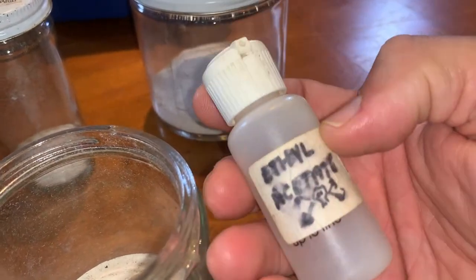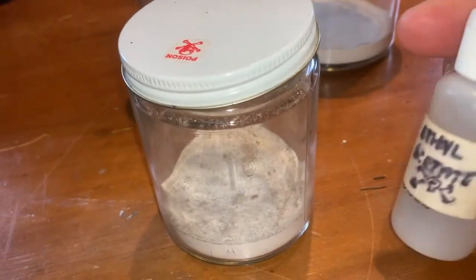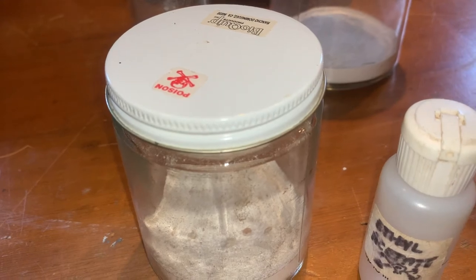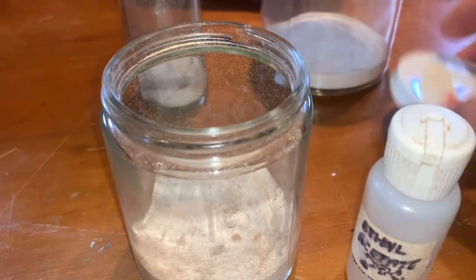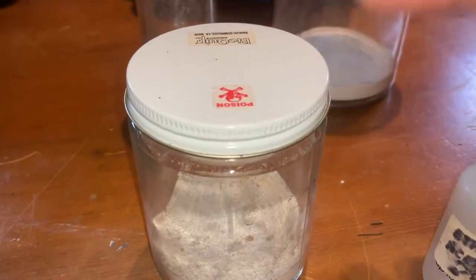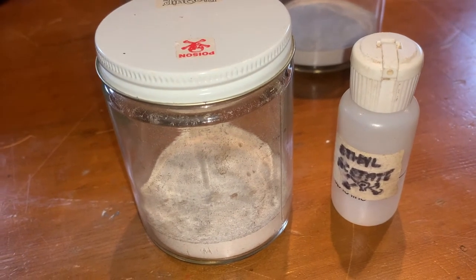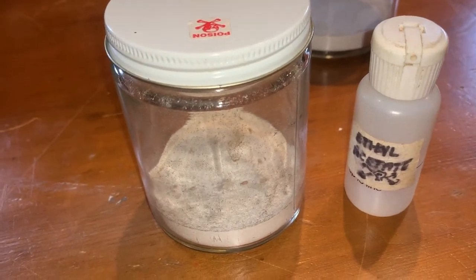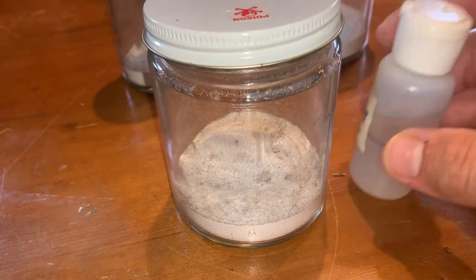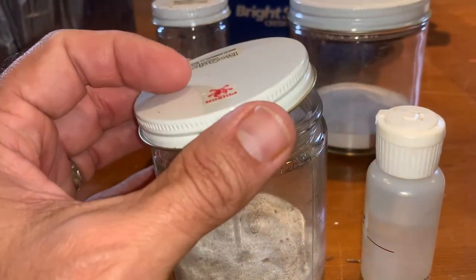When you're using your kill jars, keep your lid closed at all times unless you're putting a specimen in or out. The more time your lid is open, the more the ethyl acetate will evaporate — opening it three, four, or five times will gradually deplete the charge. If the jar is well charged, ethyl acetate knocks out a specimen in like a second or two. It's very impressive how quickly it puts them down.